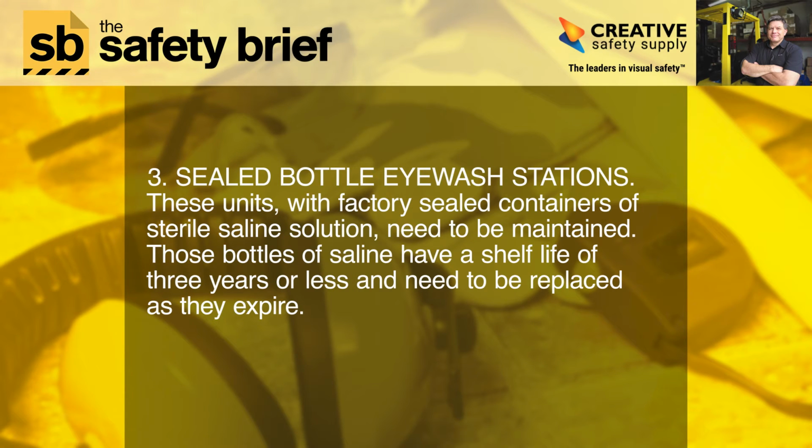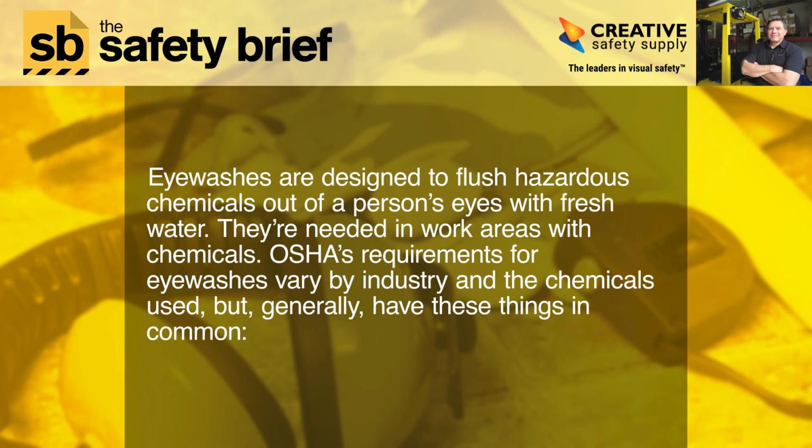3. Sealed bottle eyewash stations. These units with factory-sealed containers of sterile saline solution need to be maintained. Those bottles of saline have a shelf life of 3 years or less and need to be replaced as they expire. Eyewashes are designed to flush hazardous chemicals out of a person's eyes with fresh water.